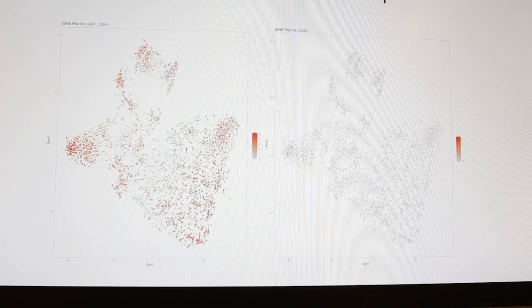So typically the CD4 transcript data isn't really useful. In this case, because we had the CITE-Seq antibody for CD4, we have information for this marker, which is typically a pretty important marker in immunological studies. And you anticipate that all of those cells should be CD4 positive?